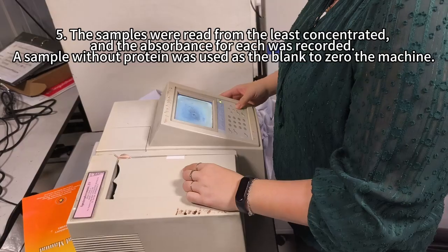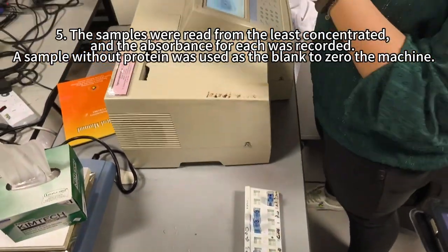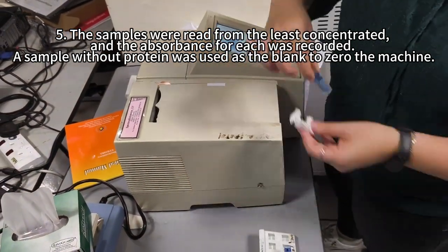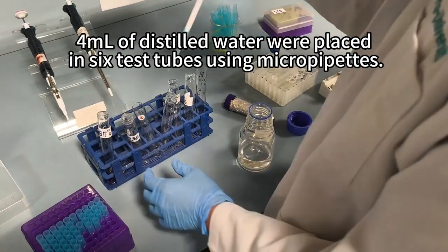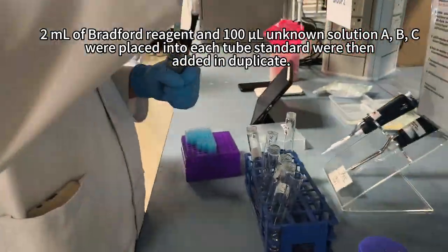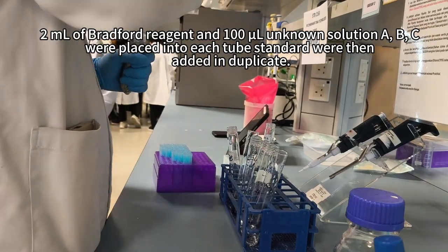Finally, the samples were read from the least concentrated and the absorbance for each was recorded. A sample without protein was used as the blank to zero the machine. In part 2, the same procedure was repeated by replacing the BSA protein standard with unknown samples A, B, and C.